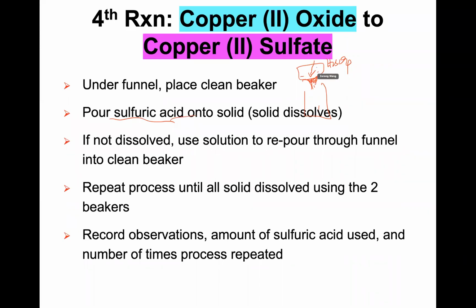Once they react, it will become soluble in the aqueous solution, right? You can see that we pour through the funnel into the clean beaker. If not fully dissolved, you can continue adding. But if your filter paper is not fully sealed and some particles drop through, then you need to repeat it again. So here you will record the observations and record the amount of sulfuric acid you use.